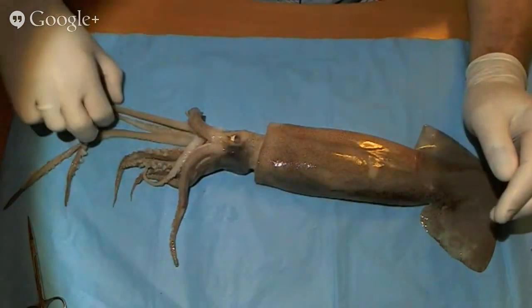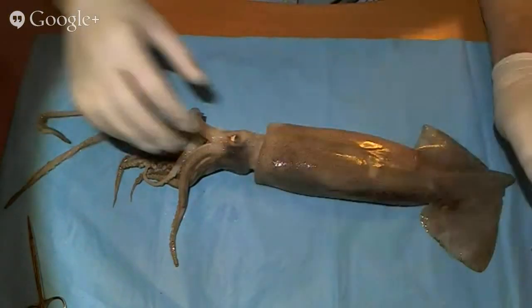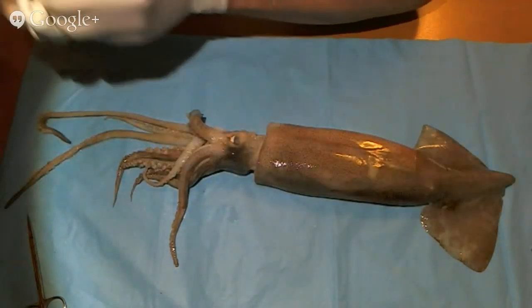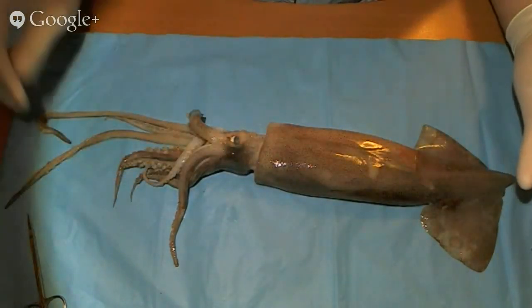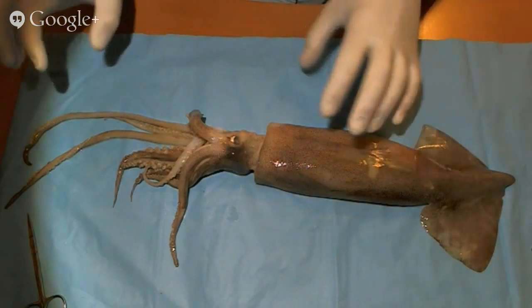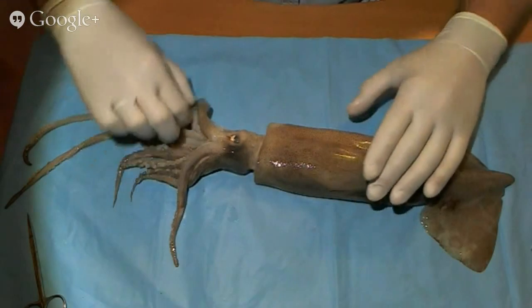If I was doing this dissection in a classroom, I certainly wouldn't cut, and I wouldn't tell you the answers. I would just ask the kids, or adults if they were doing this too, what is it that you would see that this squid uses to move? It's kind of tricky, this one. I would hope that they would see that it's not just going to be the tentacles.